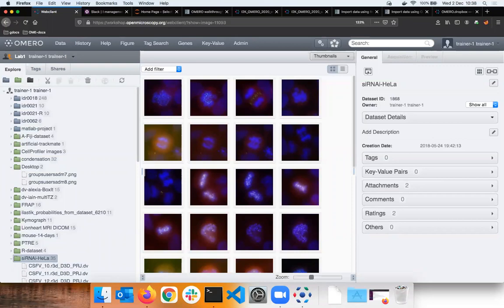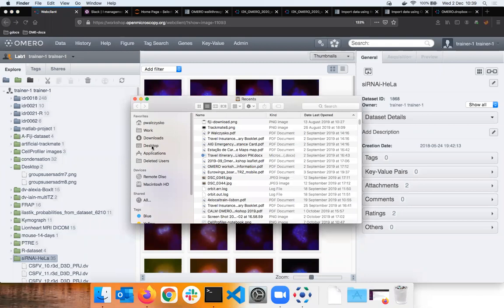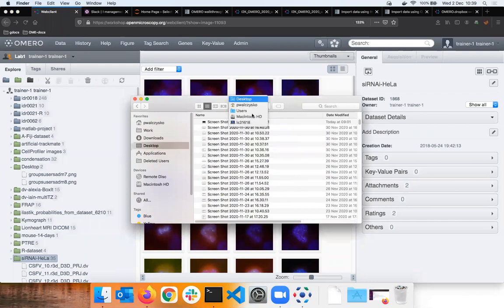I simply took it from my world. My world is like your Samba share, where there are users. Just watch what is happening on my screen. There is a folder called desktop. That's my local hierarchy.